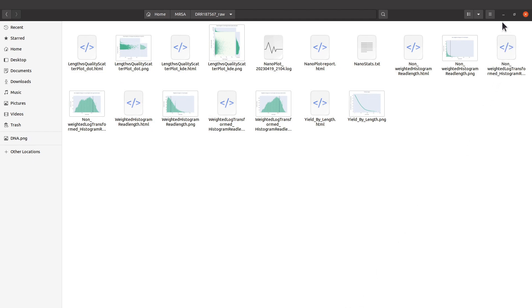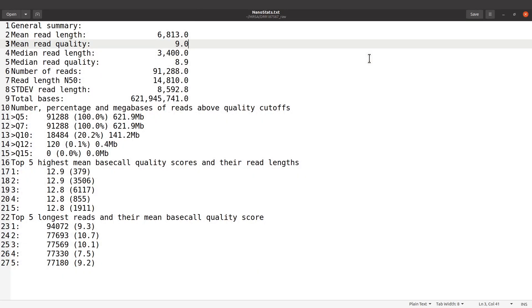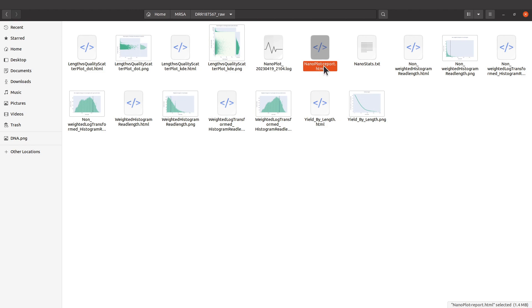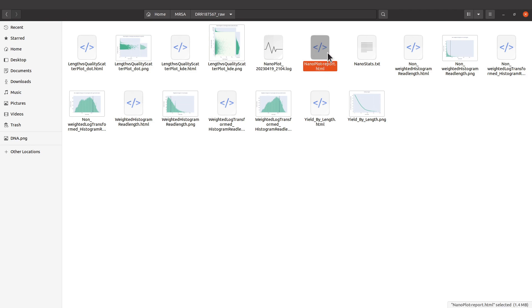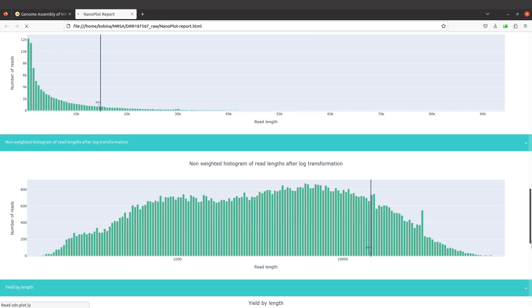These are the output files — we have images, HTML files, and text files. I'm going to focus on just these two files. This one has the summary, which you can open with any text file editor. This other file has other reports in a single HTML file including the figures and plots, so you can open it with your browser and see all of them there.